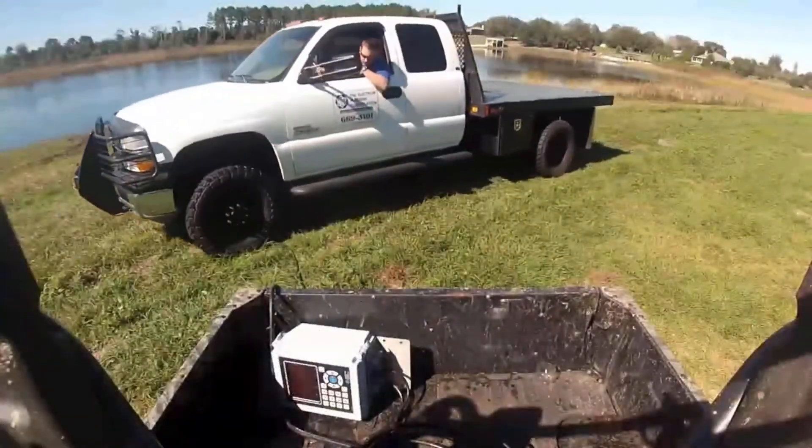Welcome to Electron Machine Corporation, manufacturer of the world's most rugged refractometer. Our refractometer is used in a variety of industries throughout the world. The next series of videos will highlight some of the most common applications for our refractometers.